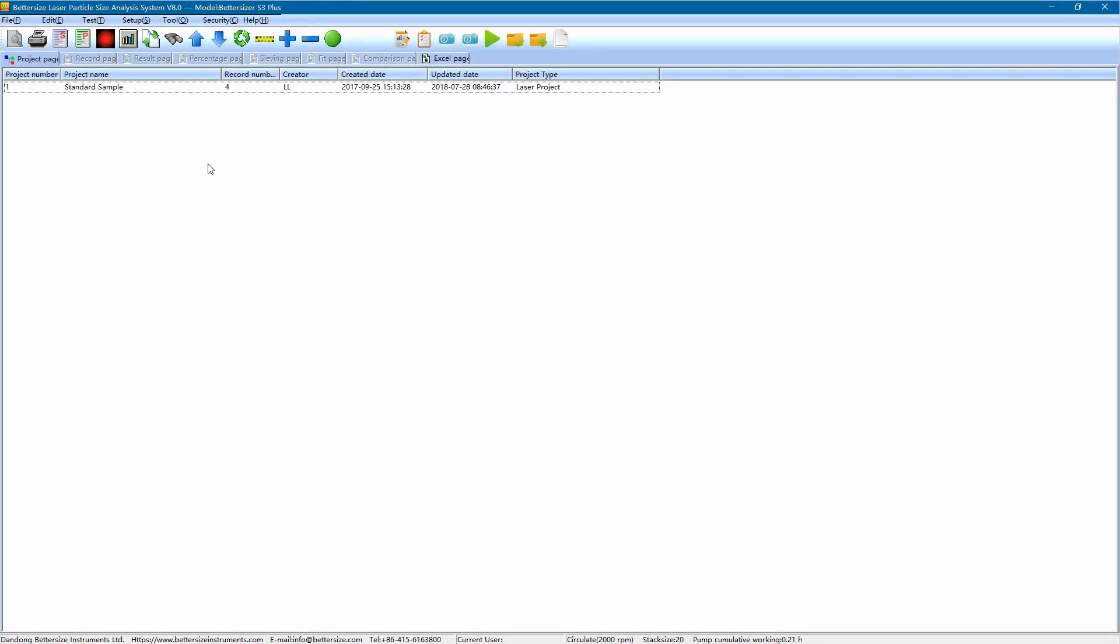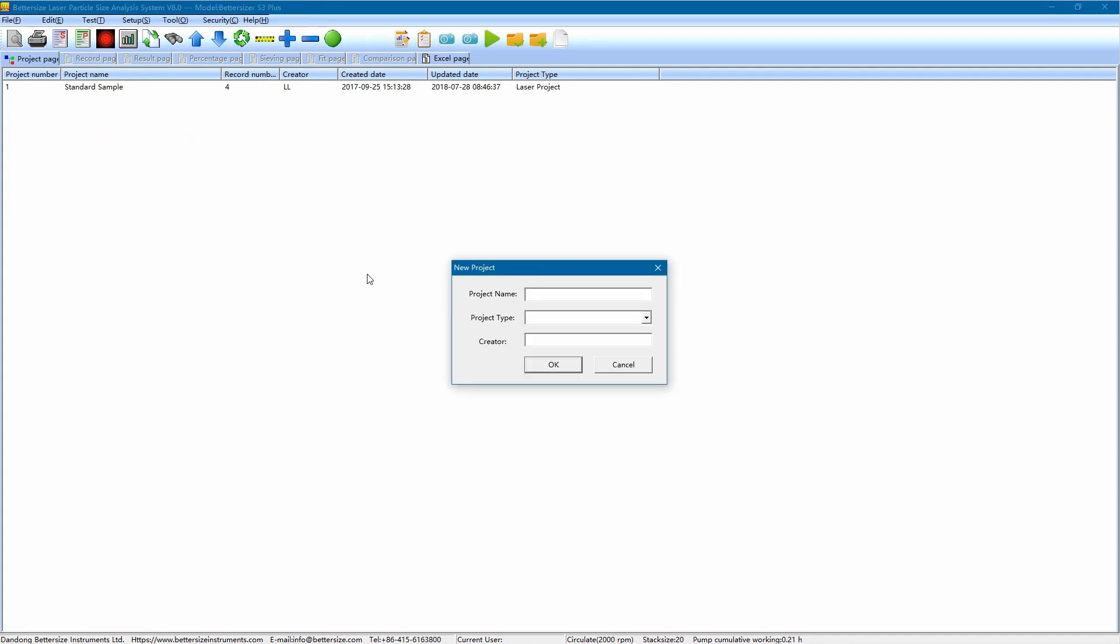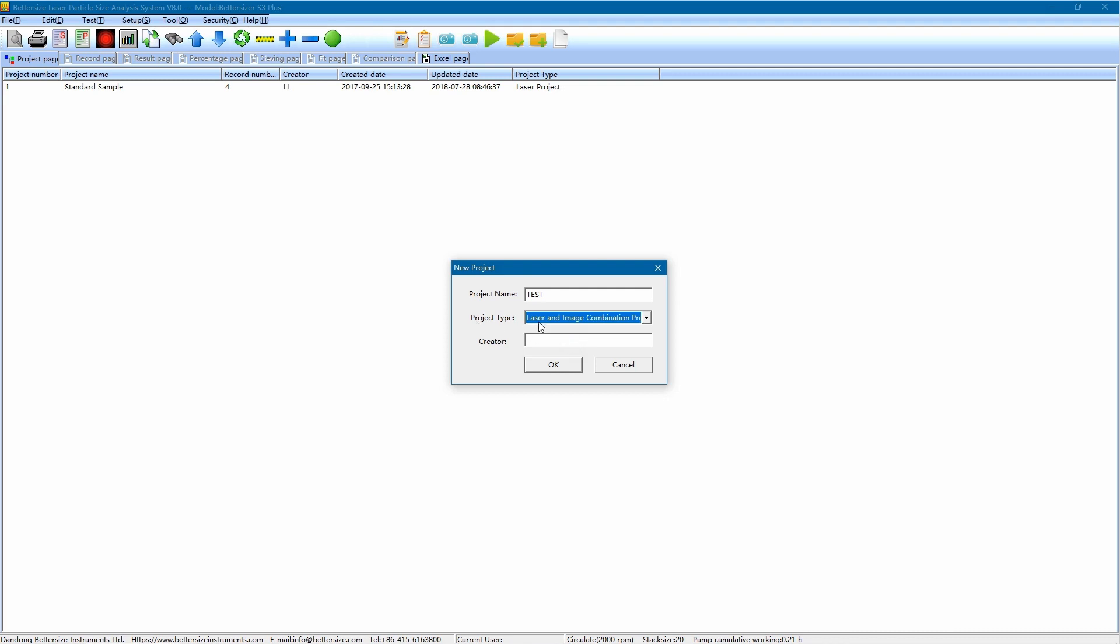This is the software interface. First, we right-click to create a new project for this test. In the pop-out window, enter the information required by the project. Here, I type in test as the project name, and I choose the laser and image combination project as the project type, and I type in my name in the creator item. Then click OK.